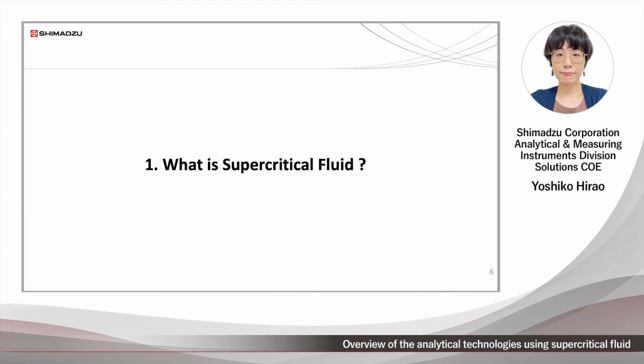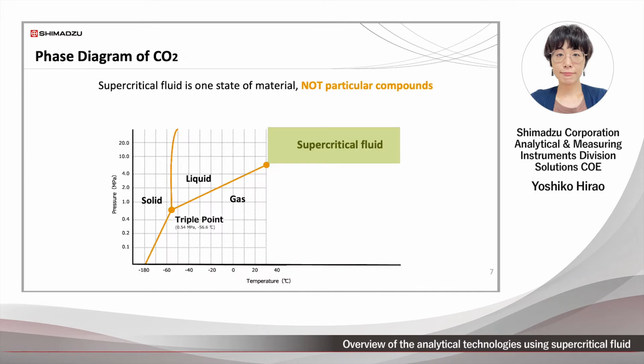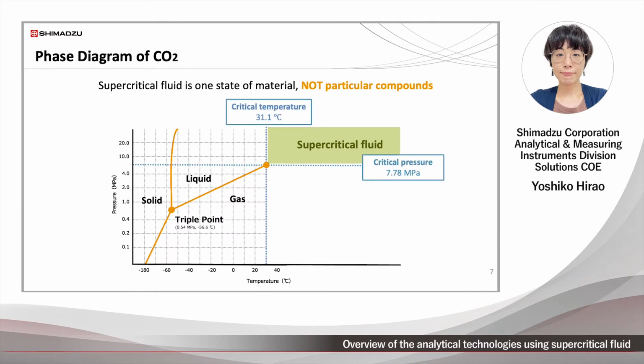First, I'll give the basic knowledge of supercritical fluid. See the phase diagram of carbon dioxide. Supercritical fluid is one of the states, not a particular compound. A supercritical fluid is generated under certain pressure and temperature conditions, and these conditions are called the critical point.